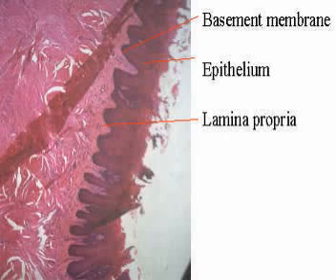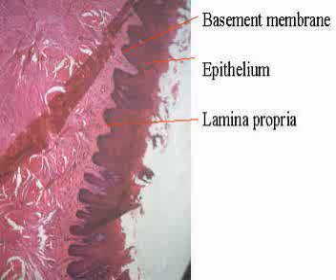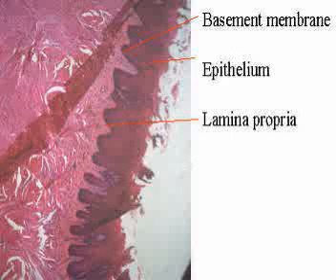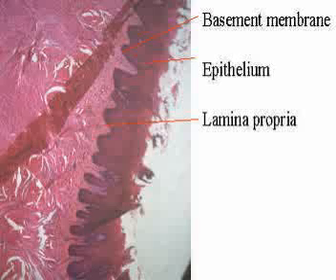It marks the end of the epithelium and the beginning of the lamina propria, a connective tissue structure which is highly vascularized with many nerve endings that is part of the mucosa. The mucosa itself has 3 structures in the gastrointestinal tract and 2 in other areas. In the GI tract, the structures are epithelium, lamina propria, and muscularis mucosae. Muscularis mucosae is absent in tissues other than the gastrointestinal tract.